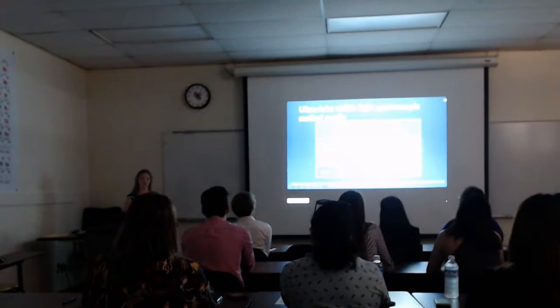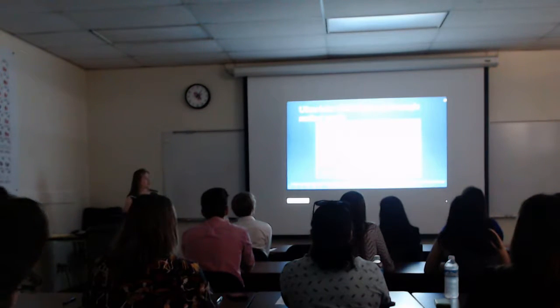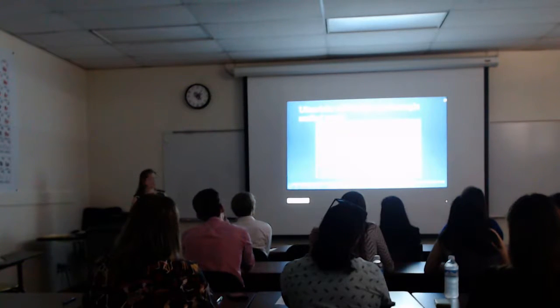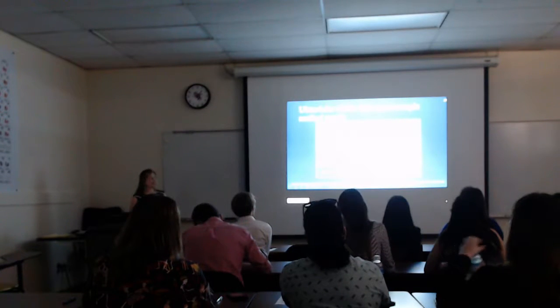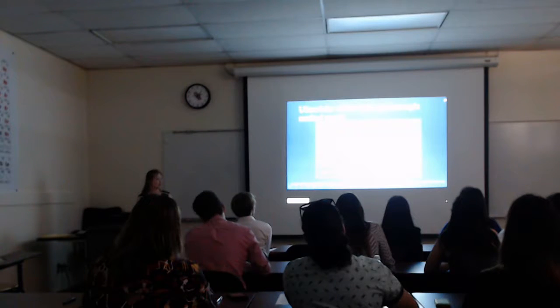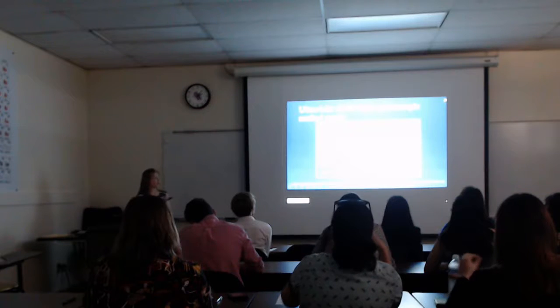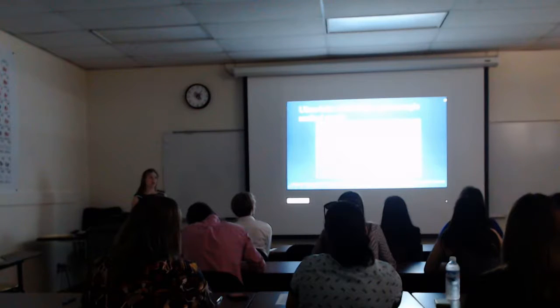And these are the method results that we got here. Again, this is how accurate the method is. This method was originally done on the Arizona clay, and we got a 1.583% error. We did it initially like this to determine if it was worth pursuing these methods to see if they could be refined. Because of this, we were given hope that it would be possible, and we went on to create those stock solutions. Unfortunately, that stock solution of copper resulted in higher percent error and higher CECs based off of the adsorption of the clays.